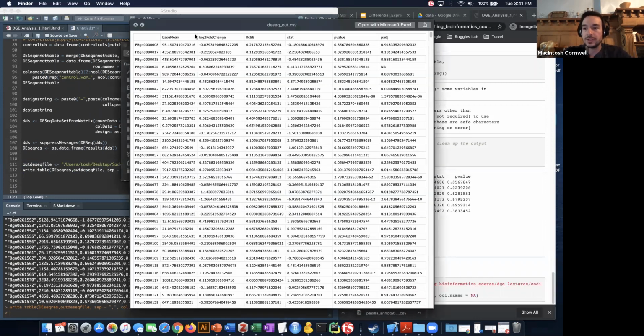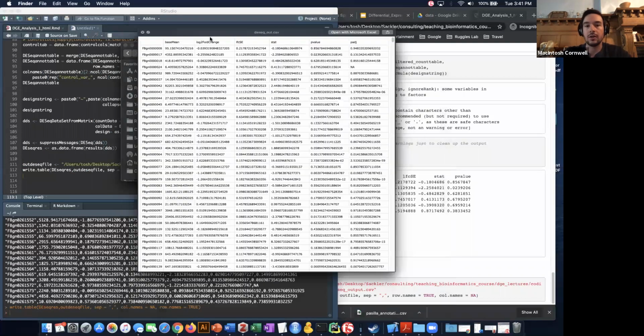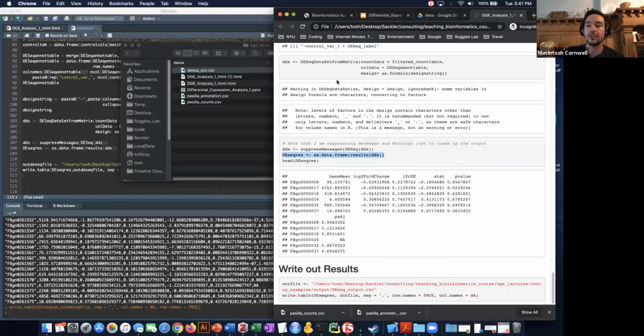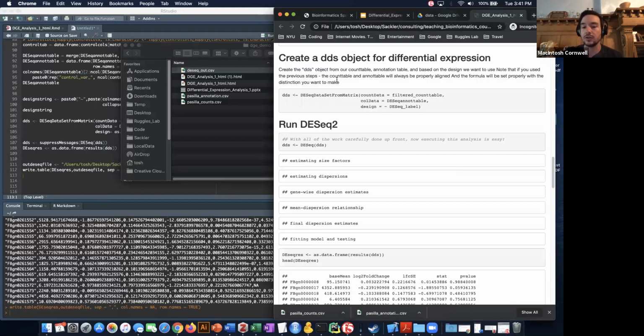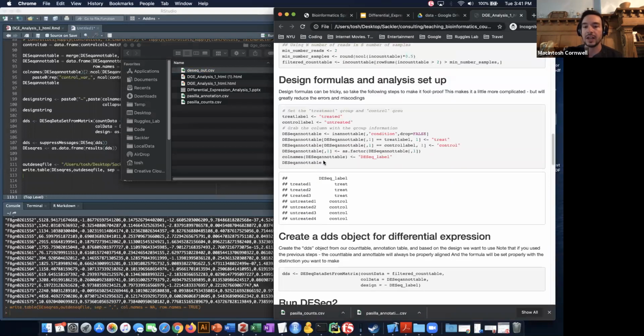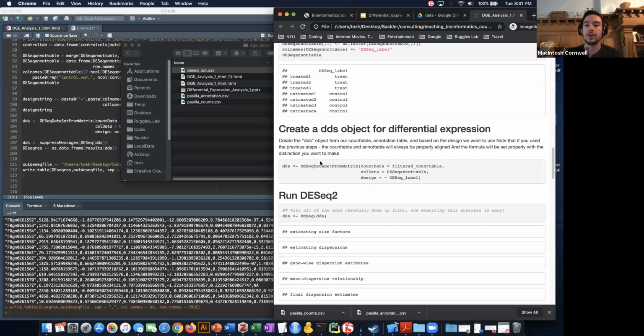So that was pretty much everything that we wanted to cover today. There are several other tools you can use, like Limma and edgeR, that work in similar ways. I'm going to say again that DESeq2 is probably the easiest because Limma and edgeR require you to build the linearized model that you then have to run your analysis on. In the end, it's not that much more coding, but it is a little more complicated. Hopefully this vignette that I created will allow you to plug and play any of your own analyses in there to run. If you follow the sections that I had here about the design strings for your DDS object, it should rule out most of the issues that you'll run into.